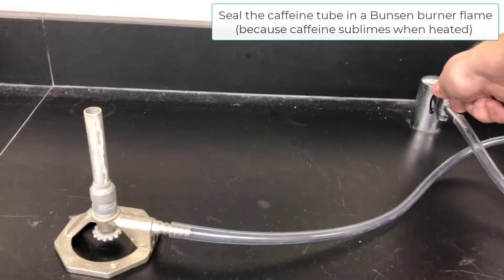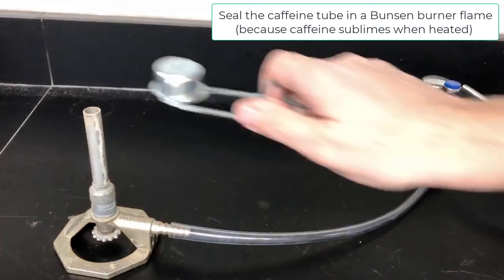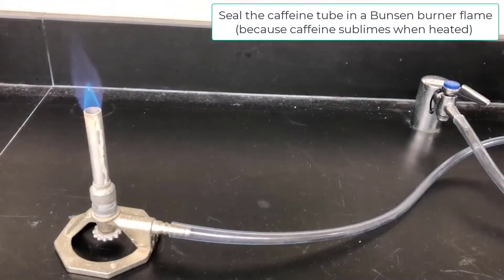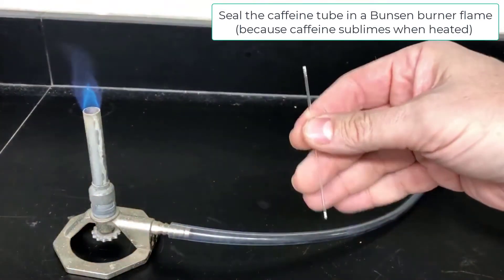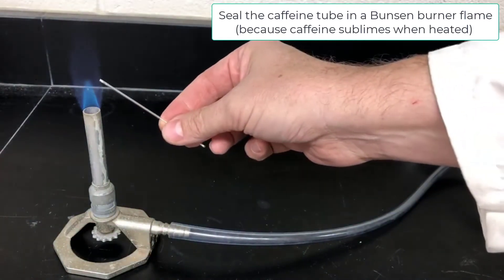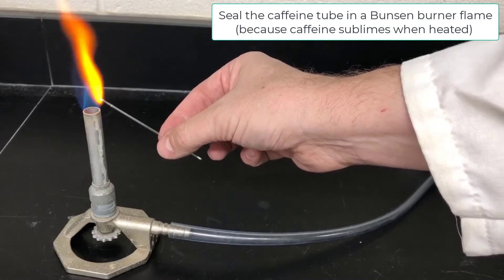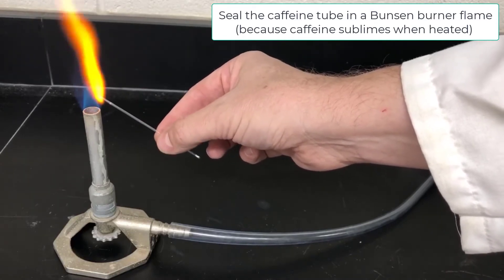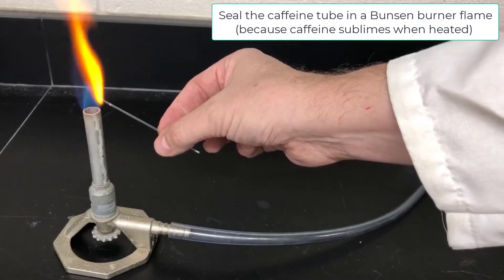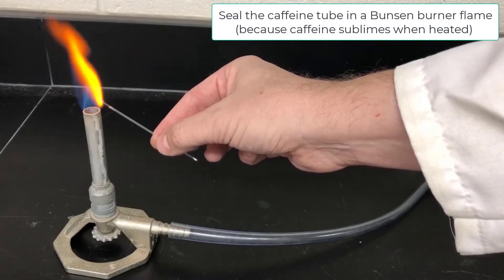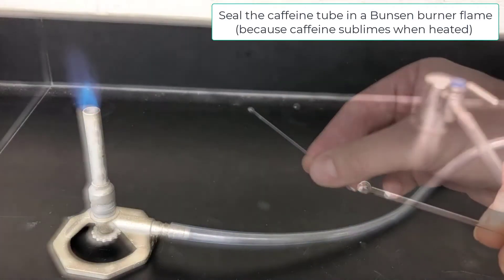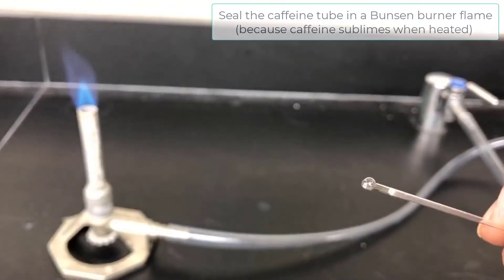Now I need to seal the top of the caffeine tube by heating it in a Bunsen burner flame until it closes up. I only need to do this with the caffeine tube, and that's because caffeine sublimes when it's heated. I'm holding the open end of the caffeine tube just inside the Bunsen burner flame to get it orange hot and rotating it. As it gets hot, the walls will get soft and they'll close up on themselves, sealing the tube. You can tell that it's sealed if you see a bubble form in the top of the tube like this.